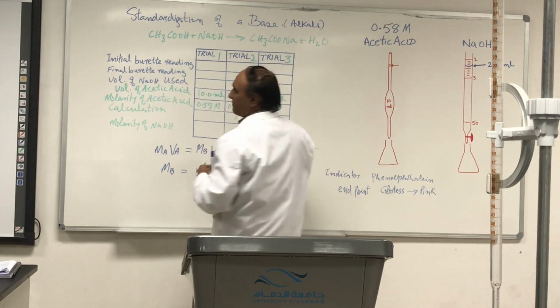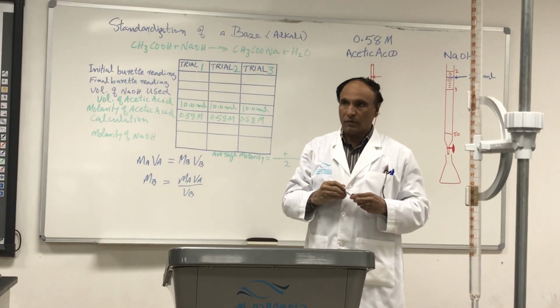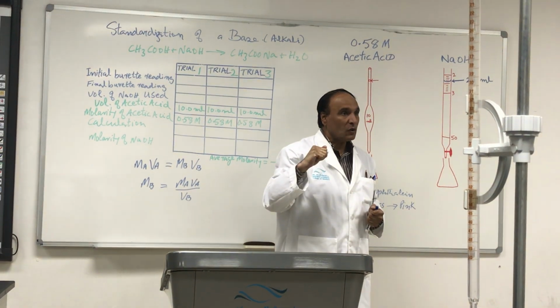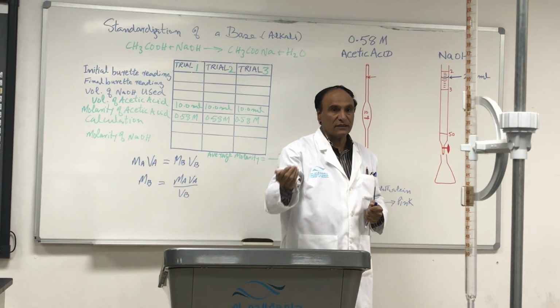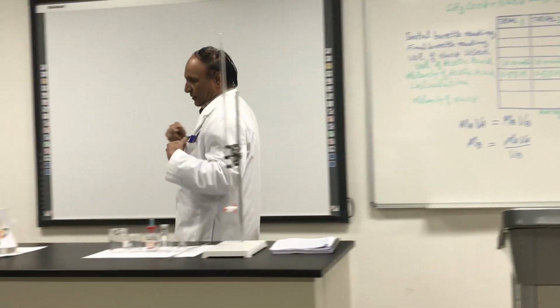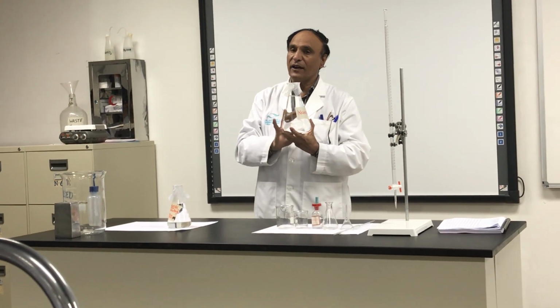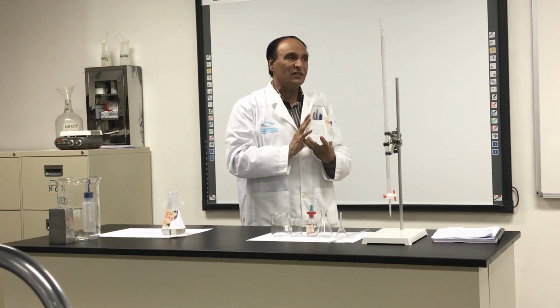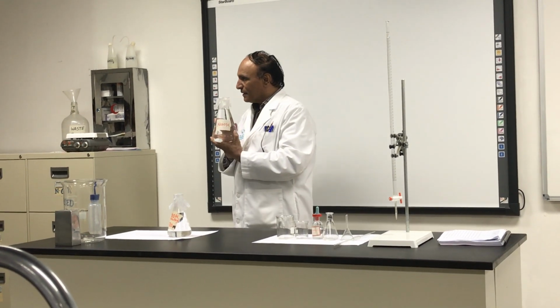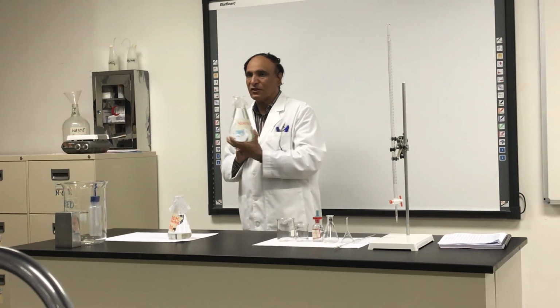This is the second name of the base for those which are soluble. I have made this solution, and we have to find out what its concentration is. Okay, this is what we want to know. We don't know the concentration of this one.